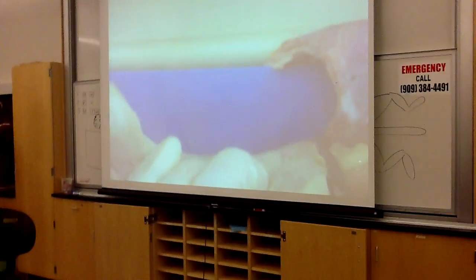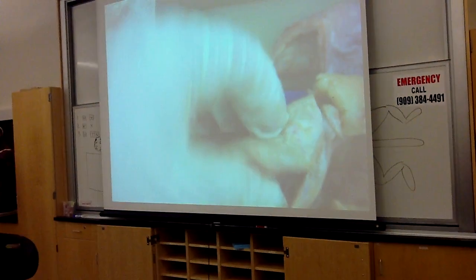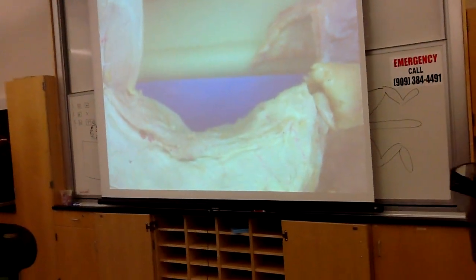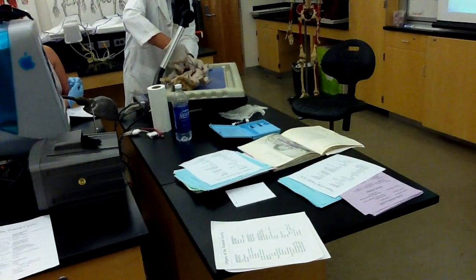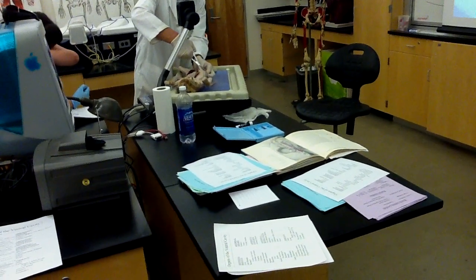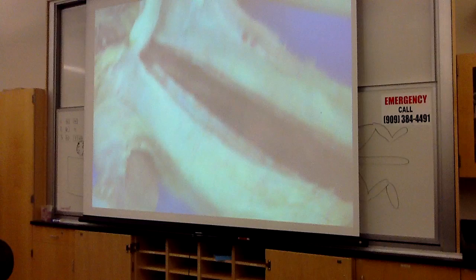And cut a good distance around the side. I had somebody in an earlier group, they made like one little cut here, and then they couldn't open the rib cage. Well, of course you couldn't. And then do it on the other side. Put your blade in next to the diaphragm. Cut this way. Try and stay right alongside it. And cut about 2/3, 3/4 of the way around the back.